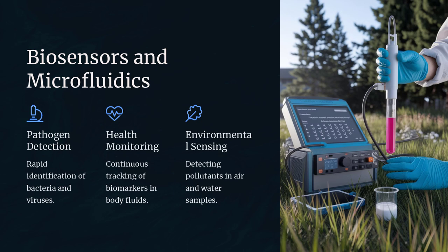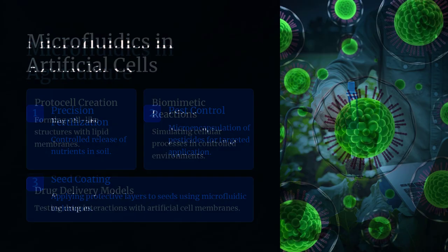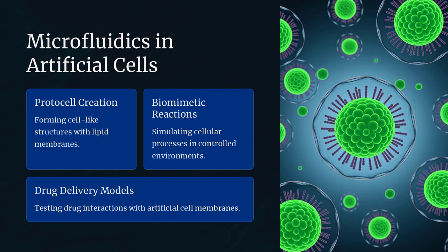a controlled manner. Despite the remarkable advancements achieved in microfluidic technology, significant challenges remain when attempting to scale these systems from the controlled environment of a research laboratory to the unpredictable conditions of industrial production. In a lab, researchers can fine-tune every parameter to achieve precise control over droplet formation, but scaling up introduces variables such as increased flow complexity, environmental fluctuations, and the need for real-time monitoring and adjustment.